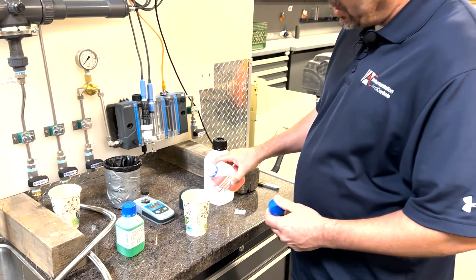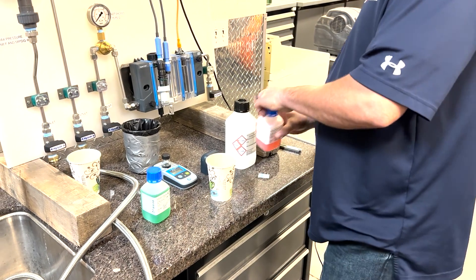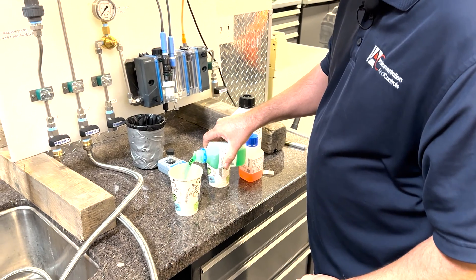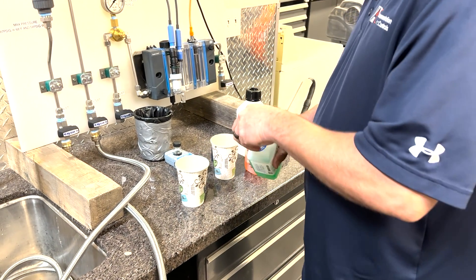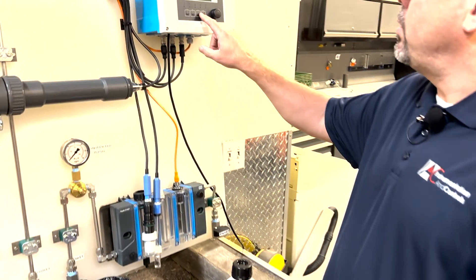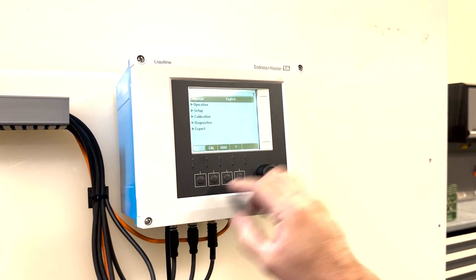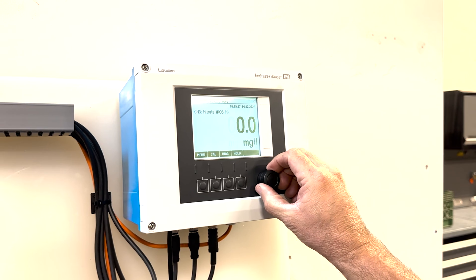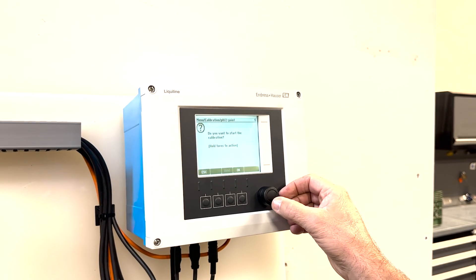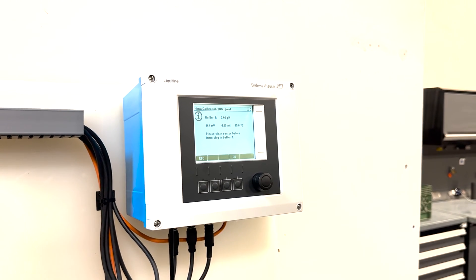We have two solutions — a 4 pH and a 7. I'm going to pour enough in here so we can fully submerge the sensor. Make sure you check the expiration on the pH buffer solution. We're going to go into the calibration menu for pH and do a two-point calibration. It's asking for buffer 7.